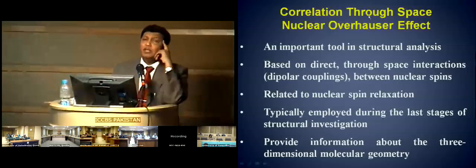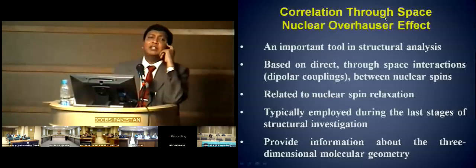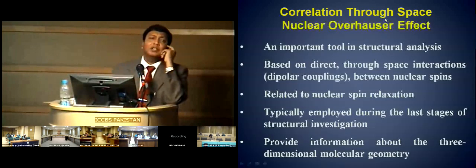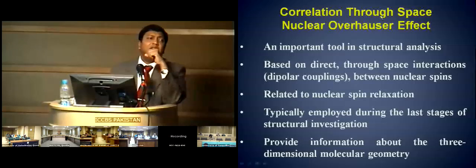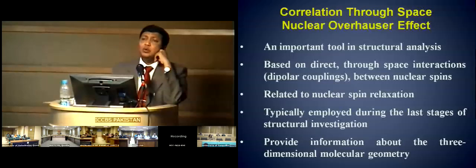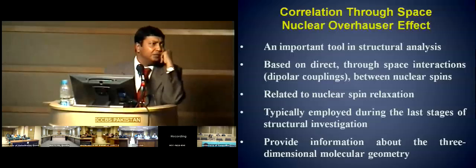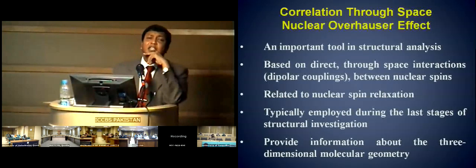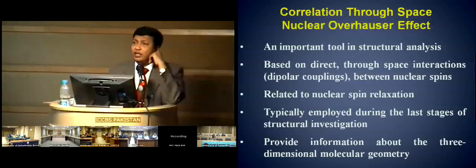Inverse NMR spectroscopy, we learned that we detect carbon through their effect on proton, and there is a tremendous sensitivity increase. And we learned that it is possible to put them together, 1-2 coupling or 1-4 coupling or 1-3 coupling, when we have HMQC and HMBC. What we have done so far is just putting bits and pieces together. We have done so far only the connectivity structure. We have not got a three-dimensional structure. We didn't even talk about conformation. We didn't talk about anything about the stereochemistry.